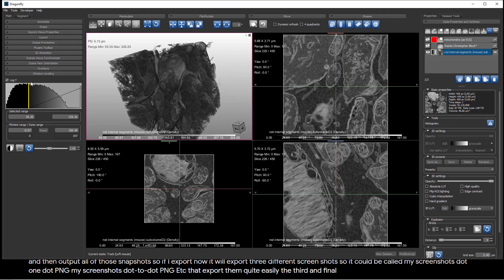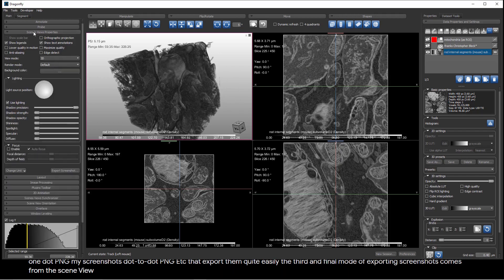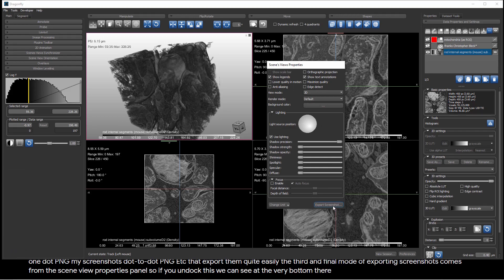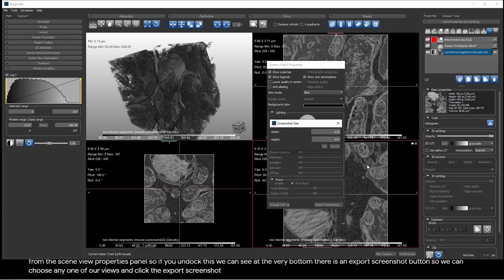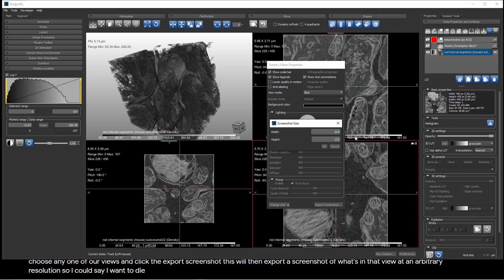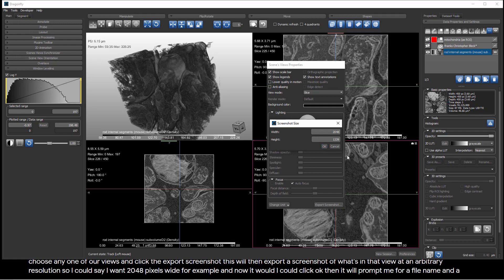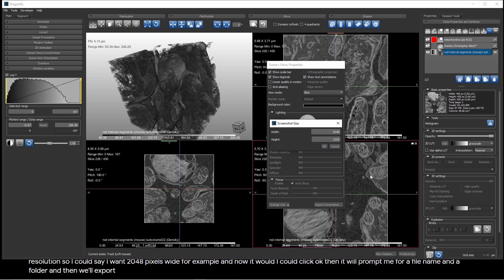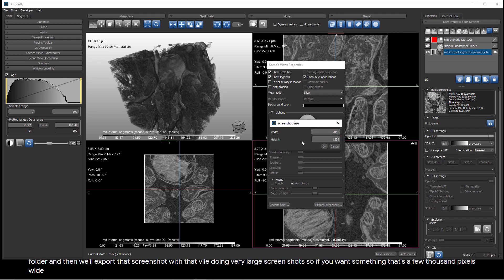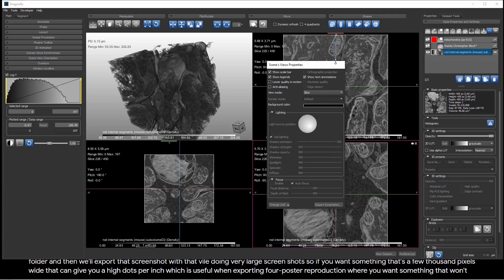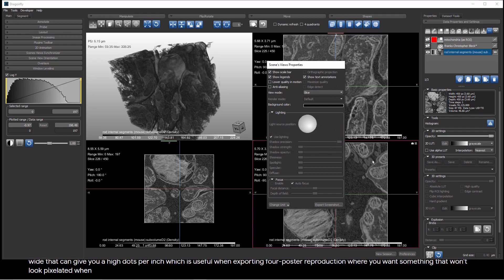The third and final mode of exporting screenshots comes from the Scene View Properties panel. If you undock this, we can see at the very bottom, there is an Export Screenshot button. So, we can choose any one of our views and click the Export Screenshot. This will then export a screenshot of what's in that view at an arbitrary resolution. So, I could say I want 2,048 pixels wide, for example, and now I could click OK. Then it will prompt me for a file name and a folder, and it will export that screenshot with that file name. This gives us the convenience of doing very large screenshots. If you want something that's a few thousand pixels wide, that can give you a high dots per inch, which is useful when exporting for poster reproduction.